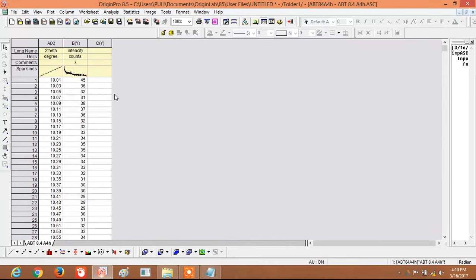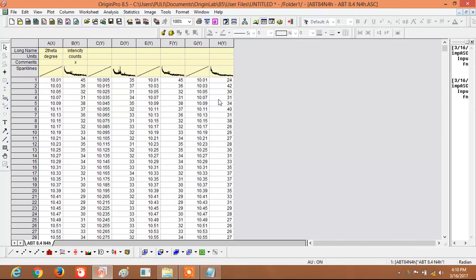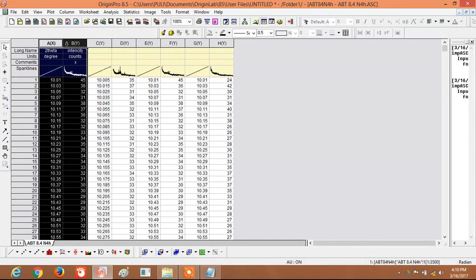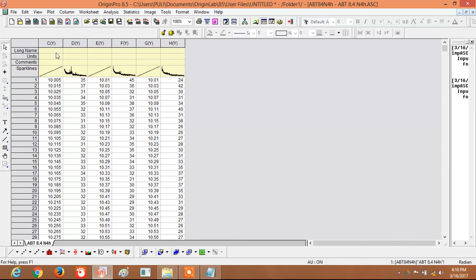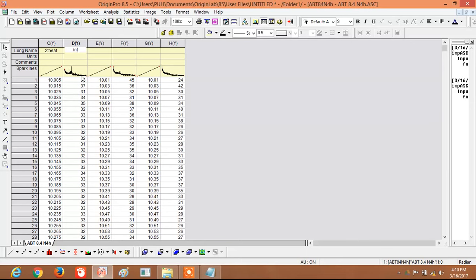Click OK and all data will appear in one sheet. The old data (two columns) can be deleted. Now we have three new data sets. This column is Two Theta and this is Intensity. Select it and copy the column settings.